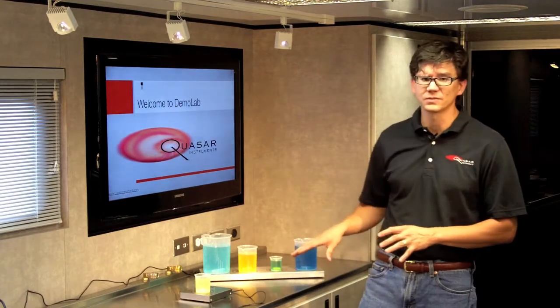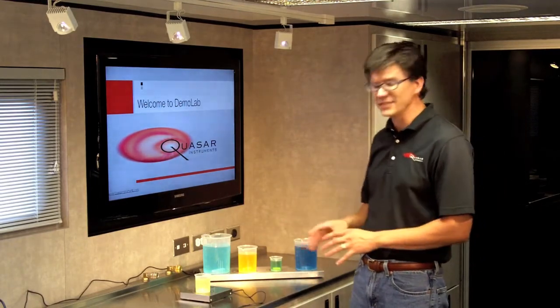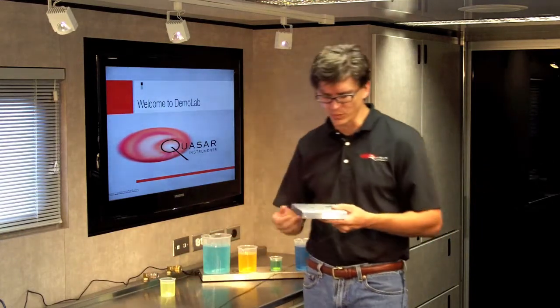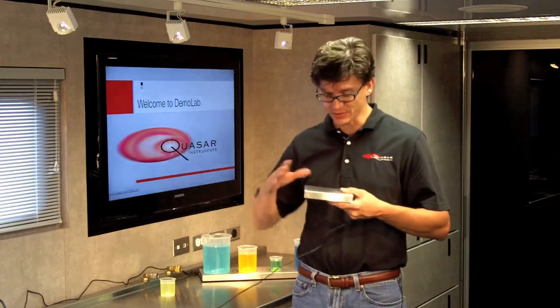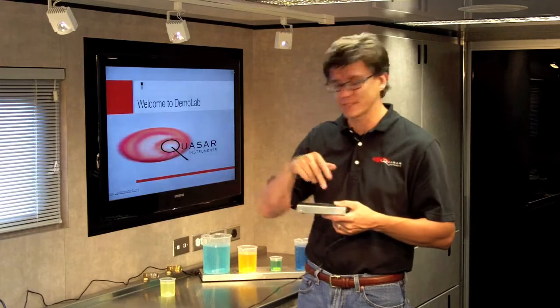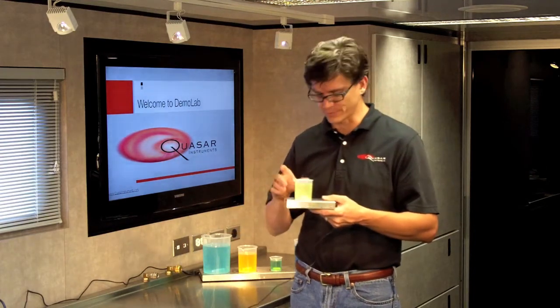The Magnetic Storm is a stir plate, but it is one of the most unique stir plates on the market. A typical stir plate will have a motor housed in the unit which is connected to a magnet. That motor will spin the magnet, which will then turn the stir bar within your sample.